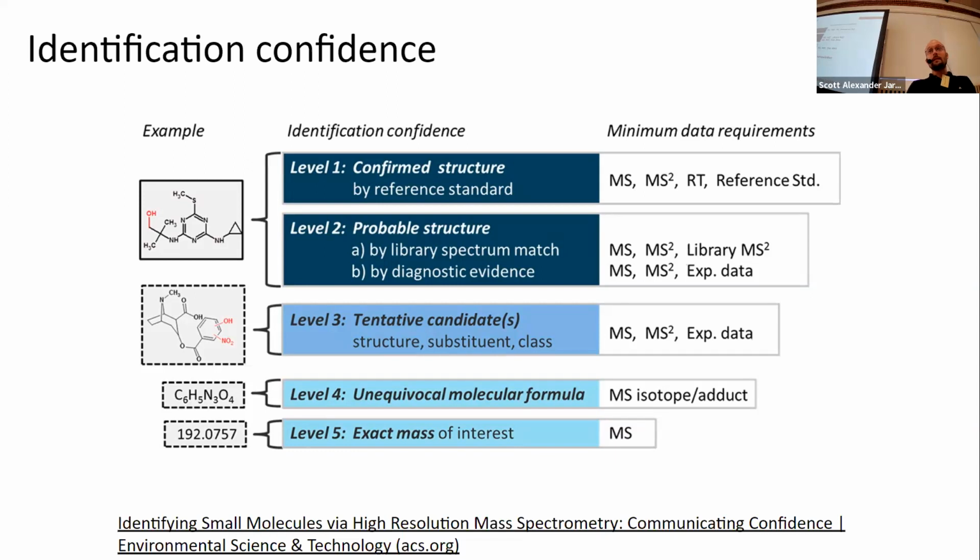What you'll come to see is that when we use molecular networking, we're mostly working on the levels of level 3 and level 2. It entirely depends on if you have what I like to call anchor points in your molecular network. So you have a reference spectrum that some of your features might link to, and then that allows you to start piecing together what structures might be possible from these other features.